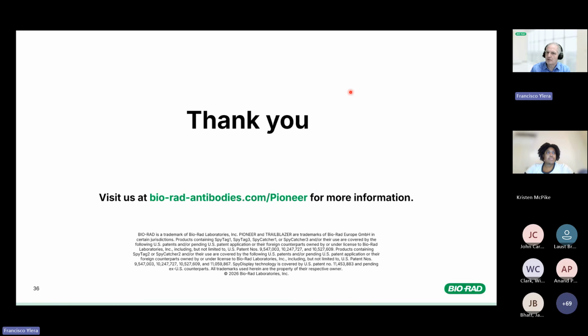So if the question aims at truncated clones, which are enriched because they are shorter DNA, shorter proteins, better expression profile, that's something we have seen in the past, not to a huge extent, but we haven't actually seen that for the Pioneer library yet. Probably because we could properly remove it from the library through this selection step, but also for the HuCAL libraries, it's a minor problem.